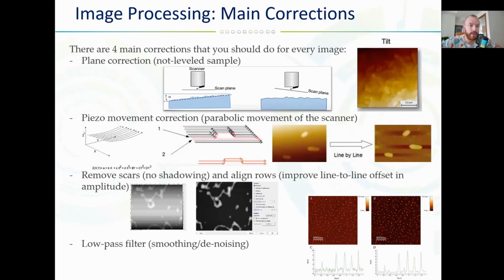And then you change the temperature not even by 1 degree, but by 0.1 degree, and you still have a change in shape, in form, in elongation, retraction, and so on. So this should be corrected, and hopefully this can be done mathematically, and you will see how it will work.